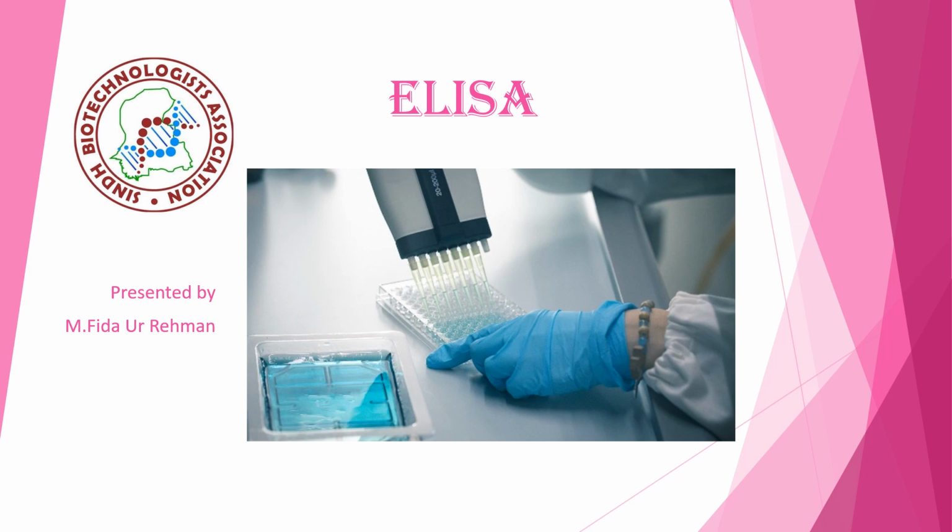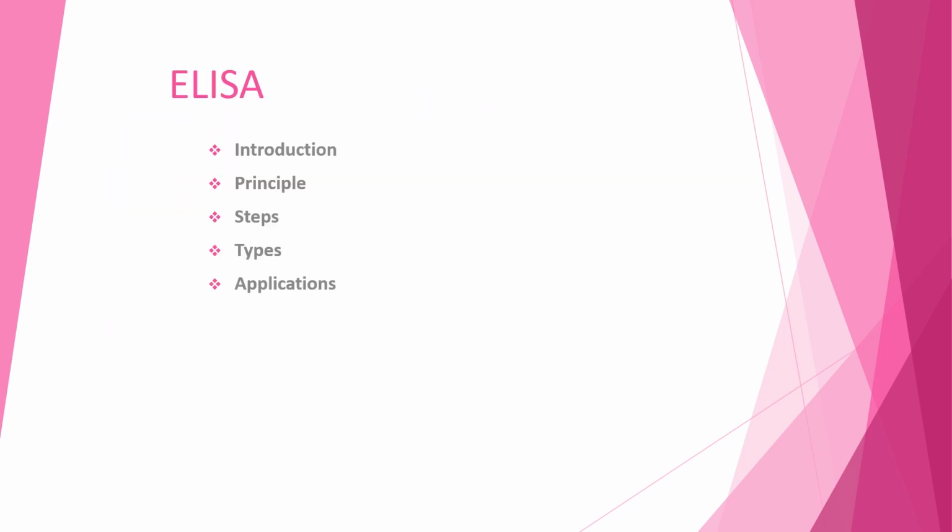Today the topic of my discussion is ELISA. Here are the main points of ELISA which we have to discuss: its introduction, principle, steps, types and applications of ELISA.